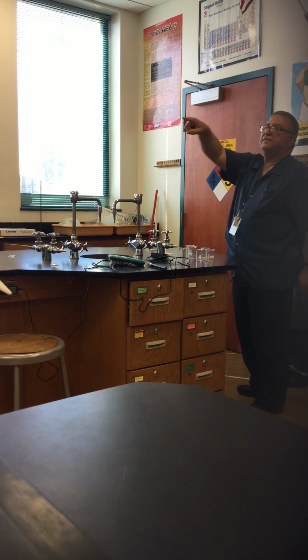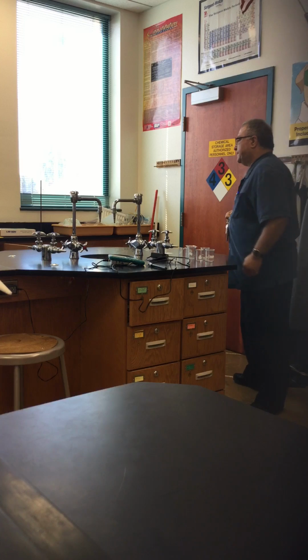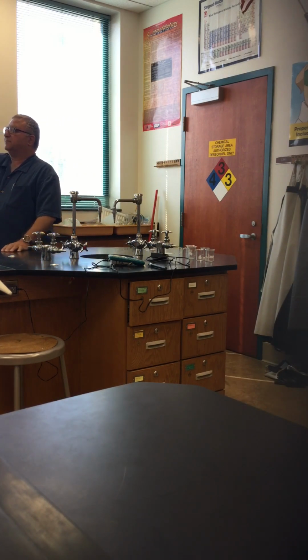Can I have the beaker at the first bench and the test tube brush? There is a test tube brush over there. At the first bench, right here, Miss Sari, over there. Come this way.